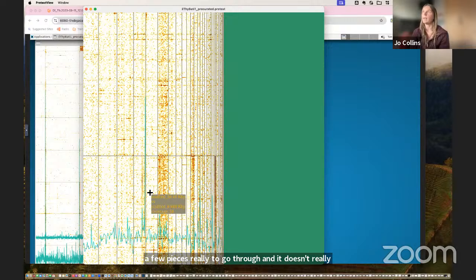In other assemblies, with very large genomes, you have to be a bit wary because some of what looks like quite small shrapnel is actually quite large chunks, which could have a lot of gene information on them. So it's almost a case-by-case situation where you're looking at the shrapnel. If it's repetitive shrapnel that can't really be placed, then obviously you don't want to invest too much time trying to get that sorted.